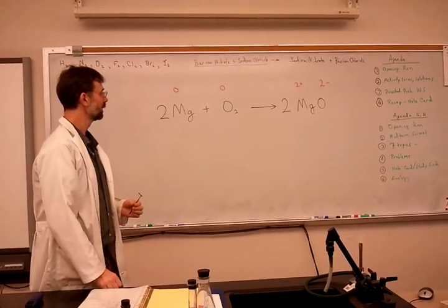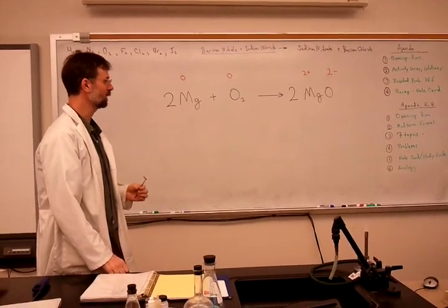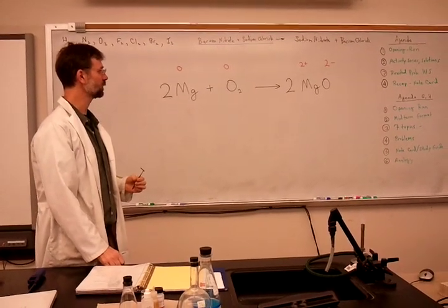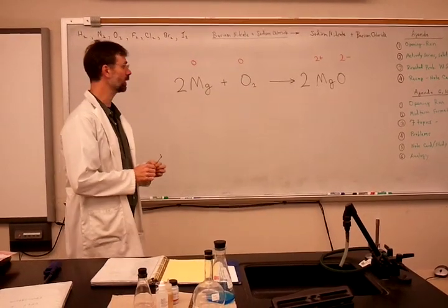We're going to demonstrate a combination reaction or synthesis reaction, but it also happens to be a combustion reaction as well.